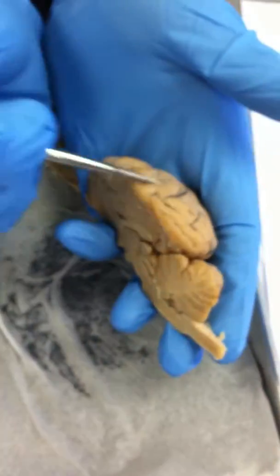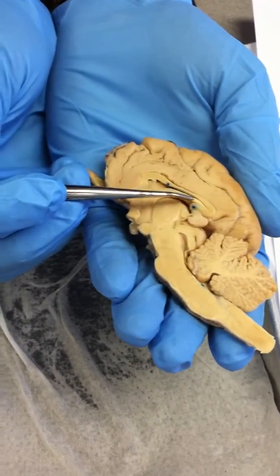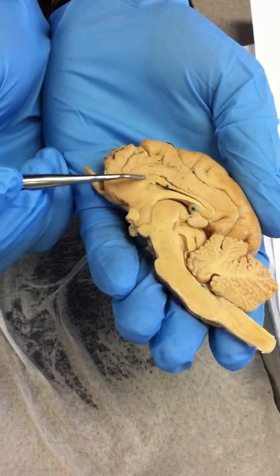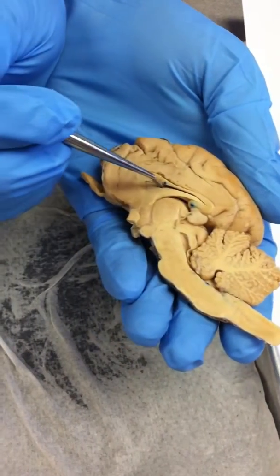Cerebrum, right? Then we have the corpus callosum. The corpus callosum is this right here, the whole thing. See it outlined? Corpus callosum. Then we have the lateral ventricle, which is this space right here.